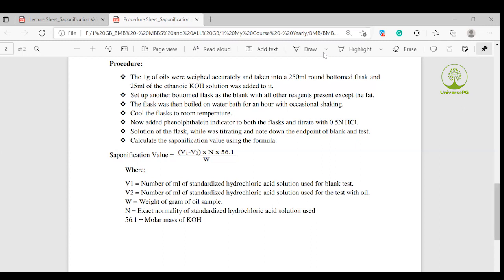The water bath temperature is 90 degrees Celsius. The flask is heated with shaking. We have the sample and the blank in round bottom flasks, and we add ethanol and potassium hydroxide to both. After heating, the flasks are cooled to room temperature.